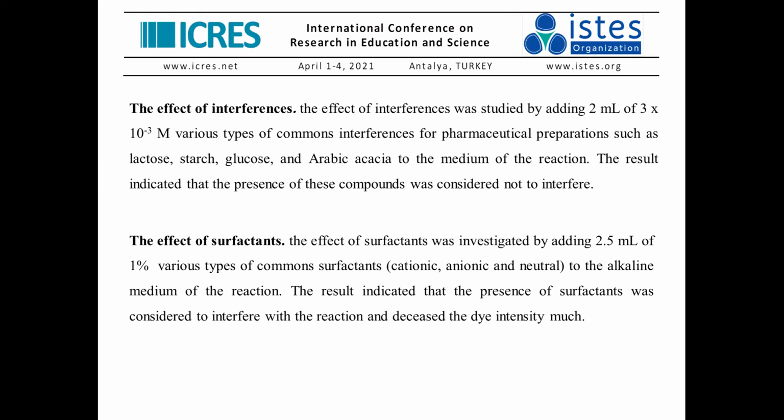The effect of interferences: as you know, in the drug formula, usually they add a lot of compounds, such as glucose, gum arabic, starch or lactose, usually added to the drugs to make them more acceptable, especially for children. Therefore, we have to make sure that all these compounds don't affect our procedure. Therefore, we studied the effect of the interferences, and we found that almost all of these additive compounds don't affect our experiments.